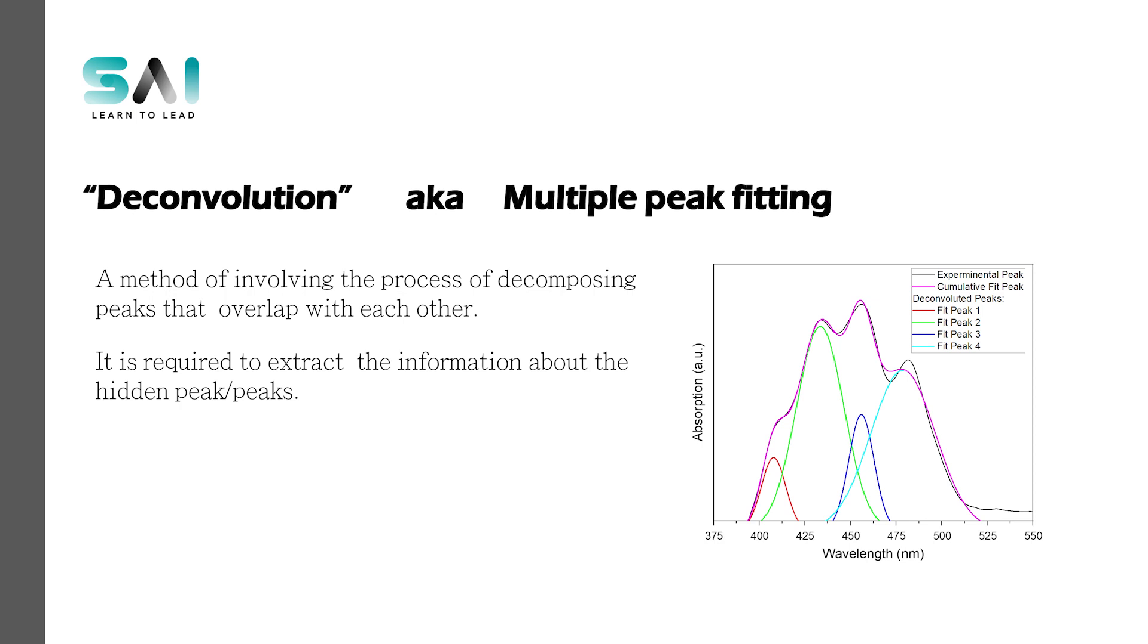First we need to understand what is the deconvolution of the peaks. It is a method which involves the process of decomposing peaks that overlap with each other and it helps to extract the information about the hidden peaks.